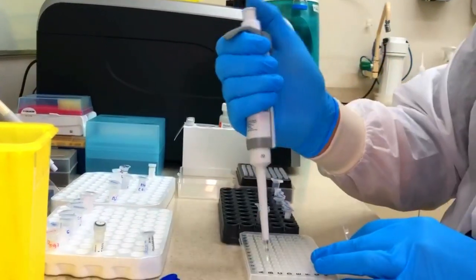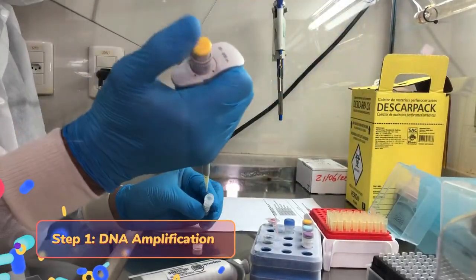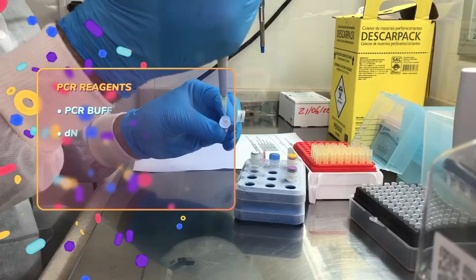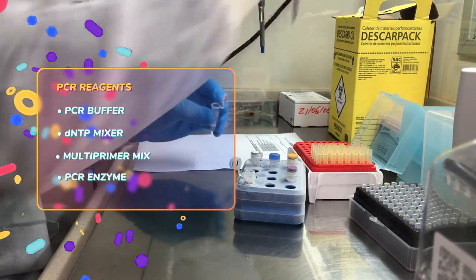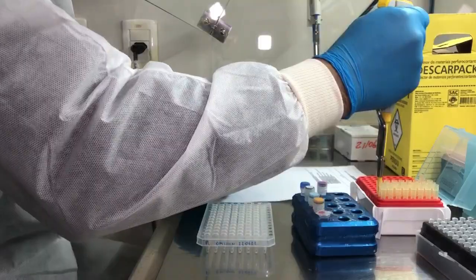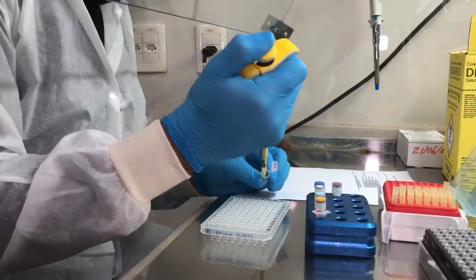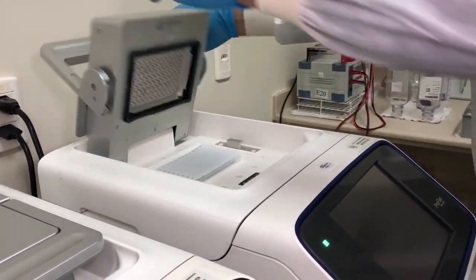The PCR is done by mixing the following reagents, all provided by the vendor except water: PCR buffer, dNTP mixture, multi-primer mix, PCR enzyme, and water. The reaction is done using 10 microliters of DNA and 15 microliters of the PCR master mix.